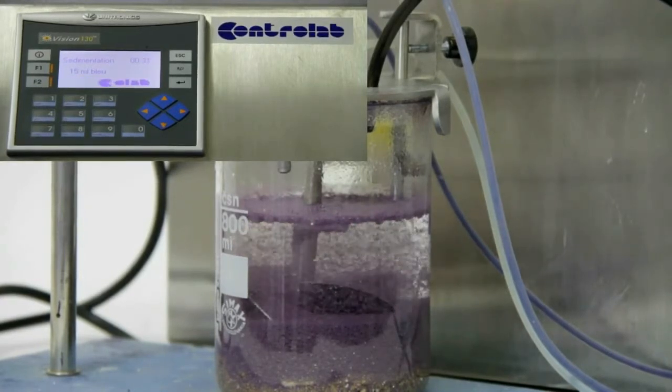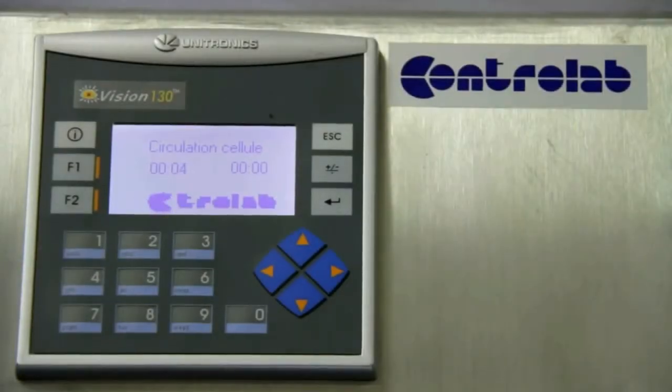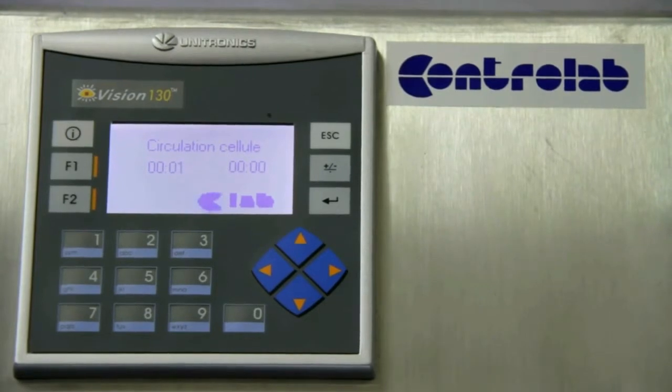Then, the liquid agent flows through the cell so that the spectrophotometer measures absorbance. This is called the concentration of blue in the solution.